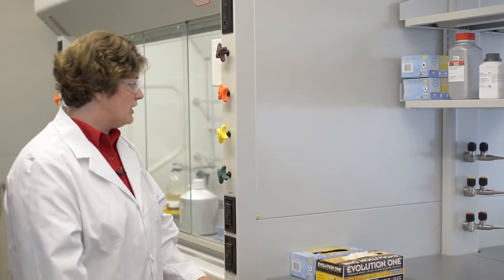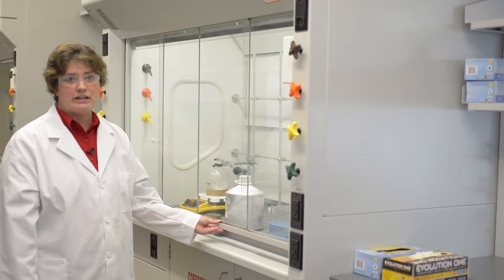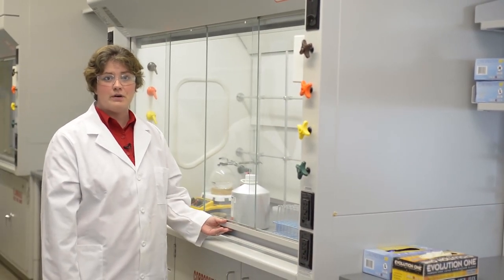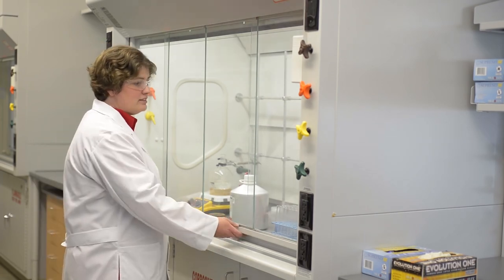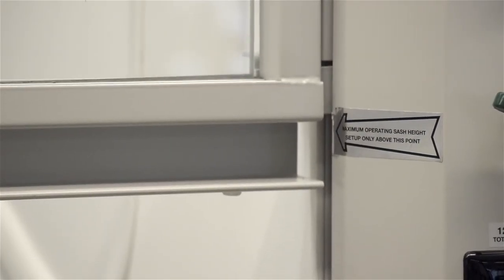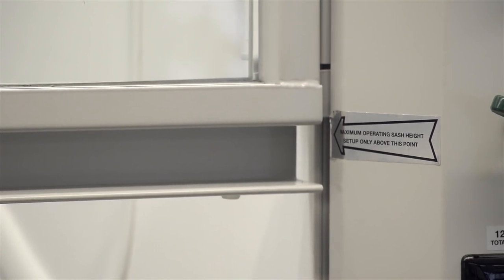When you work with volatile substances or hazardous chemicals, you'll want to be sure and work in a chemical fume hood, so it's important you know how to use one. You want to raise the sash only up to the maximum operating height, which is either 14 or 18 inches.